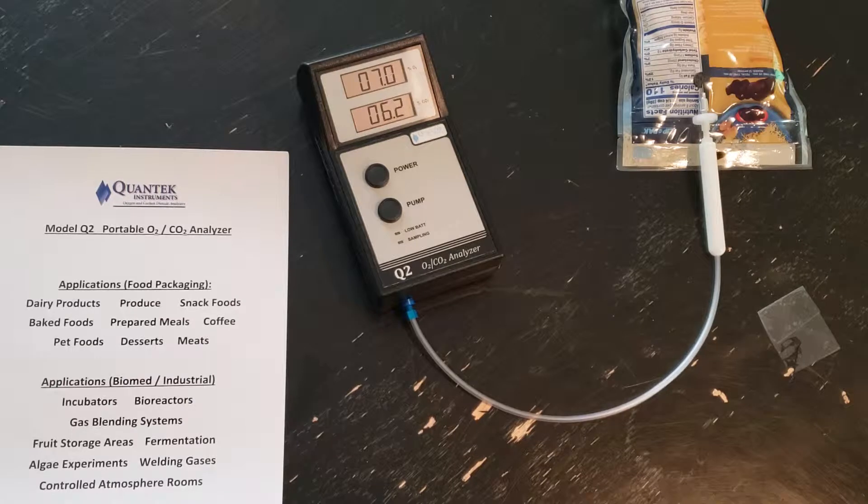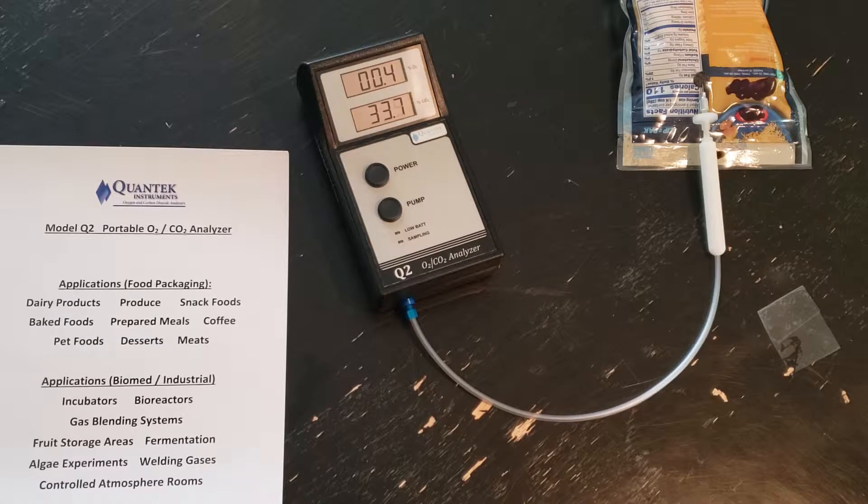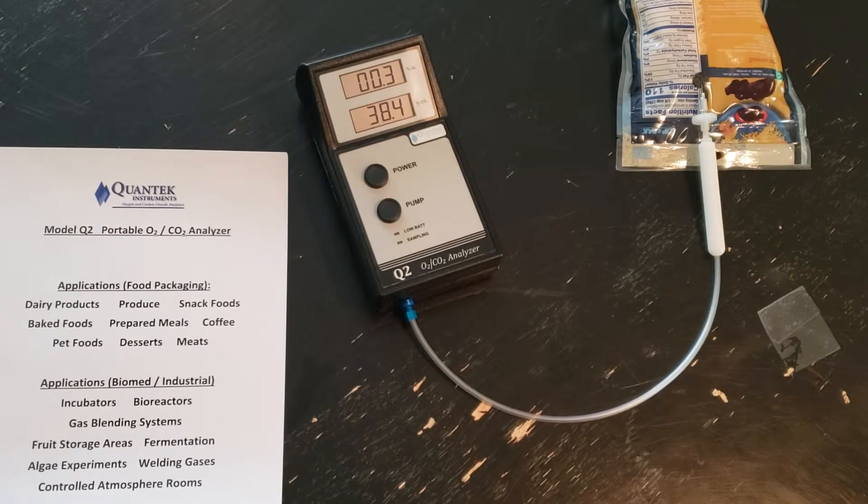This will take approximately 30 to 35 seconds to obtain a good reading. Your package should have at least 25 cc's of headspace. The CO2 is settling in. The oxygen is about 0.3%, so they did a great job of removing the oxygen from this package. The CO2 level is about 38, a little higher.